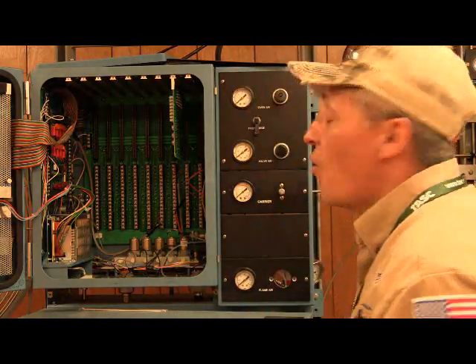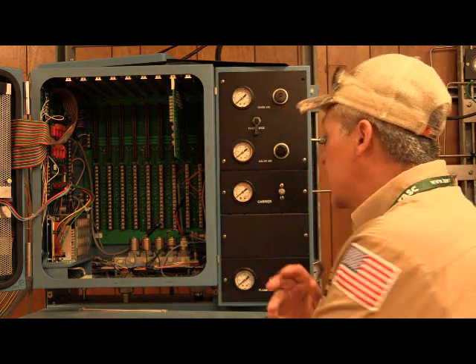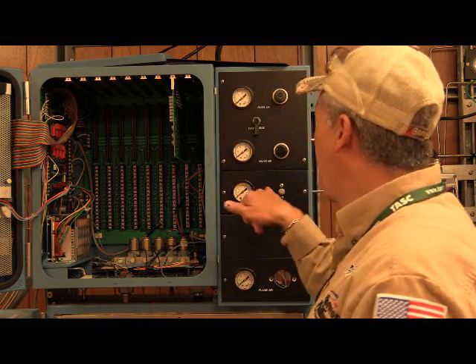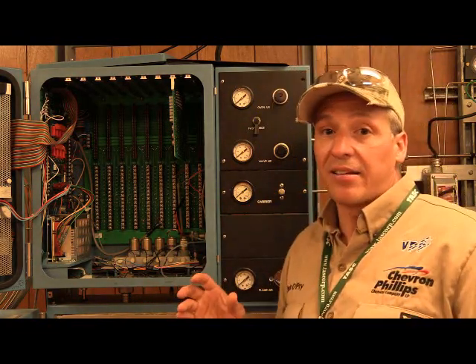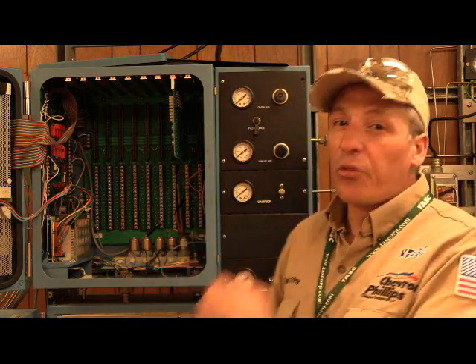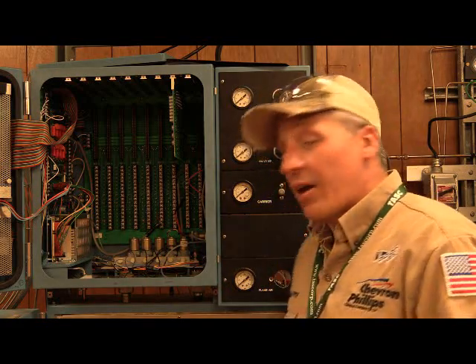We were discussing some of the things that you absolutely have to have in a GC for it to work. The first thing we said you have to have is a carrier. The carrier will come in to this regulator right here. The carrier regulator sets the pressure that you're going to use to push everybody through the GC and make them go to the detector after they're separated out with columns.